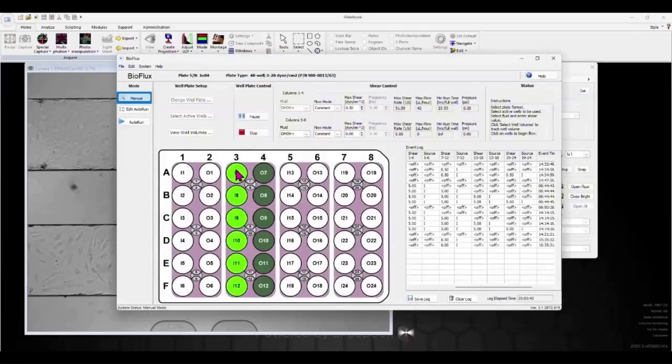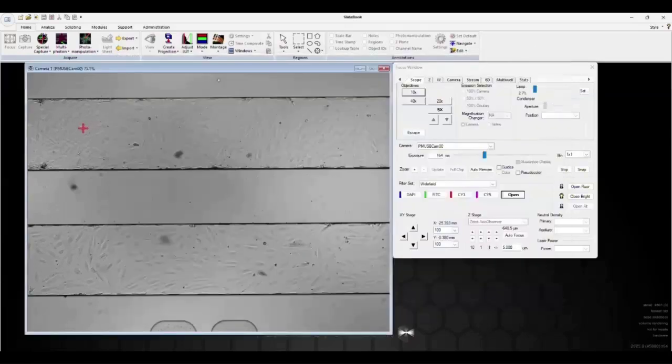We should soon see the Jurkat cells flowing through the microfluidic channels. We'll give them a few seconds to reach the viewing window. Because we're testing adhesion to two conditions, unactivated and activated HUVECs, we expect to see more adhesion of Jurkat cells to the bottom microfluidic channel than the top.